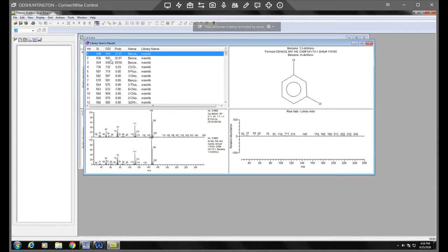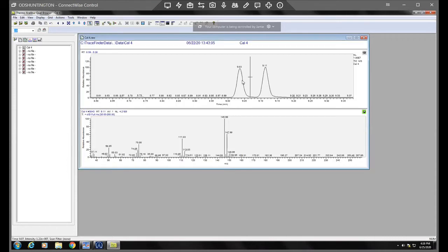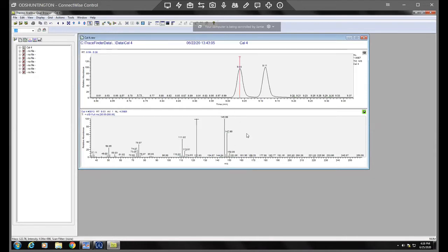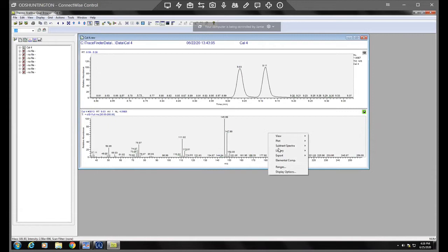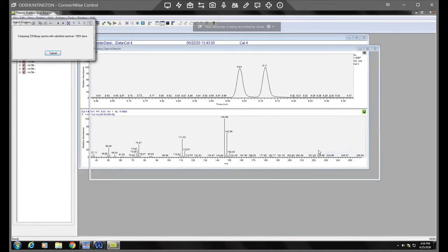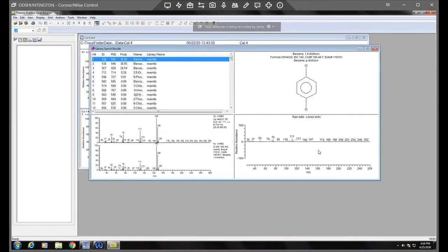So we'll do the same process. So I'm going to just click on that to bring up its spectra, right click library and search. And here's one four dichloro benzene.